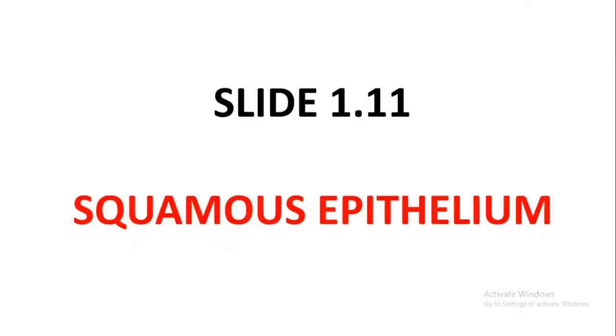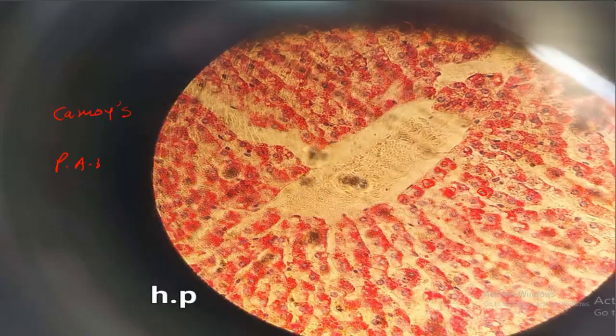All right, so when you talk of the exam part, you'll be required to identify the slide. They'll tell you to identify these slides. They can ask what made you know that this is the slide. They'll ask you which stain was used. They'll ask you which fixative was used to preserve the glycogen granules. So make sure that you understand that.